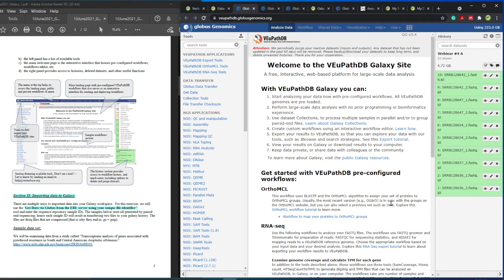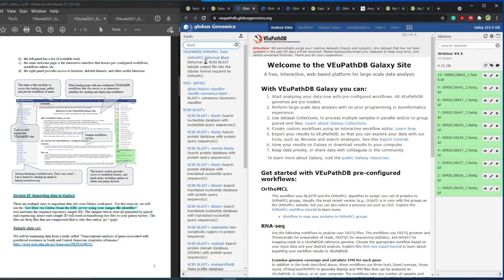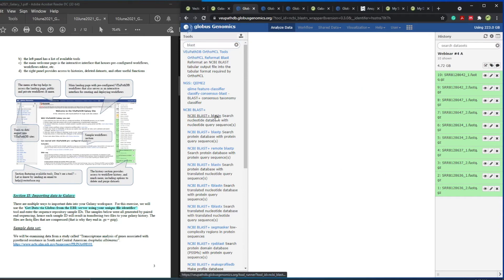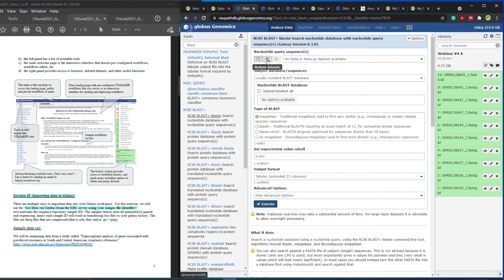Let me show you the anatomy of the Galaxy page. On first visit it could be a little bit overwhelming, but the left side is where you find the tools. For example, to use BLAST, you just type a keyword and an autocomplete suggestion appears — whether you want BLASTN or BLASTX. You select the dataset from ones you've uploaded, provide all the parameters, and click execute. The history pane on the right shows all datasets you have uploaded and results of tools you have run.